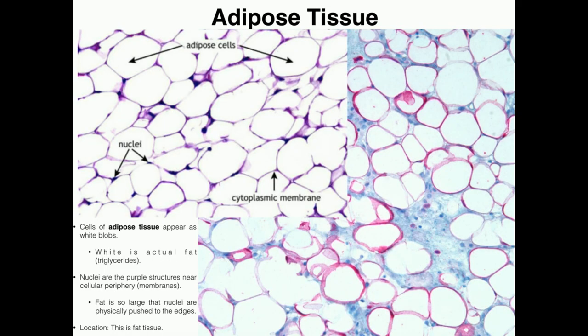Now we've got three other tissues which are actually a little bit easier. This is a very easy one to recognize: adipose tissue. This is body fat.